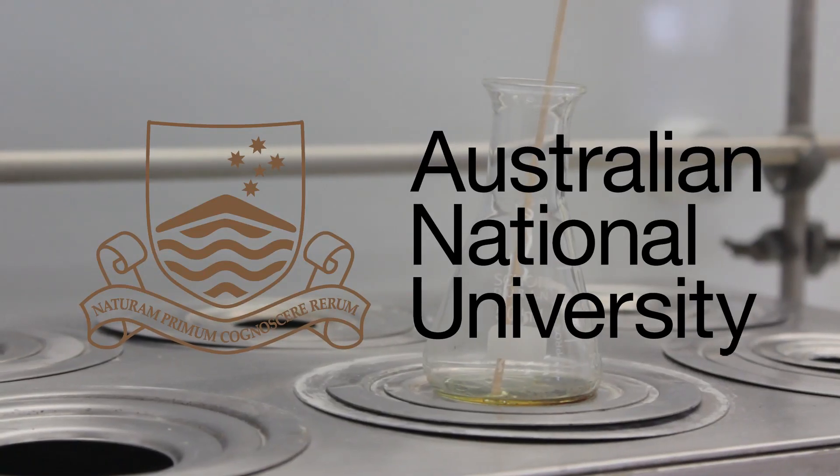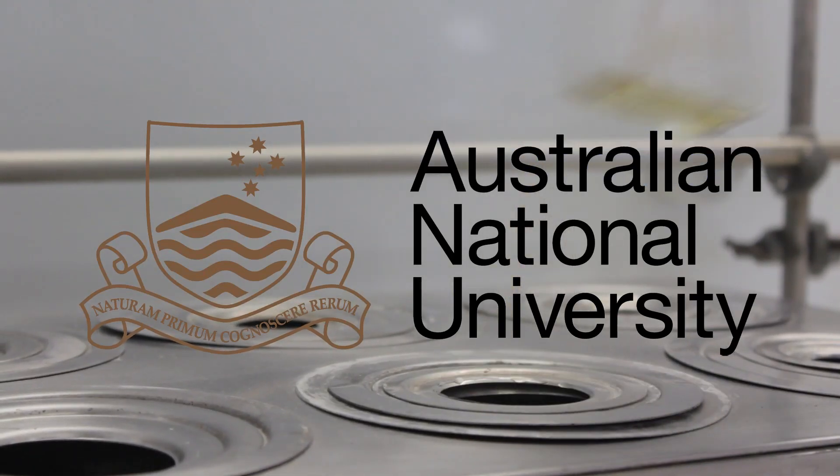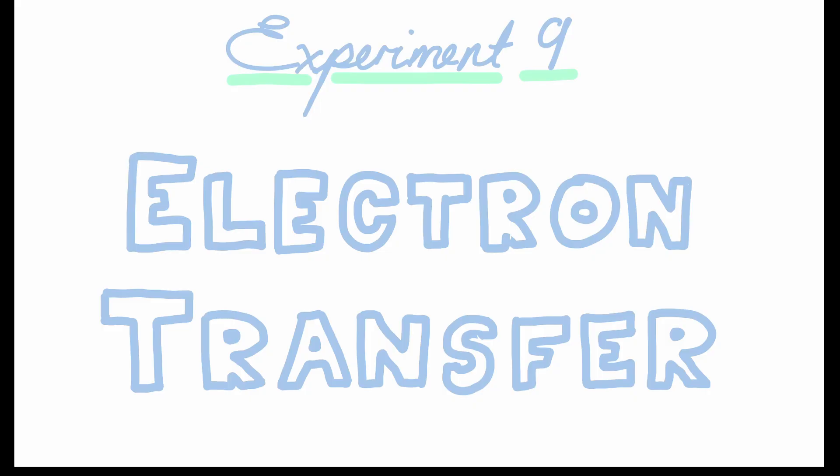This video has been brought to you by the Research School of Chemistry at the Australian National University. Today we'll be comparing electrochemical couples and ranking them in order of their standard electrode potential.